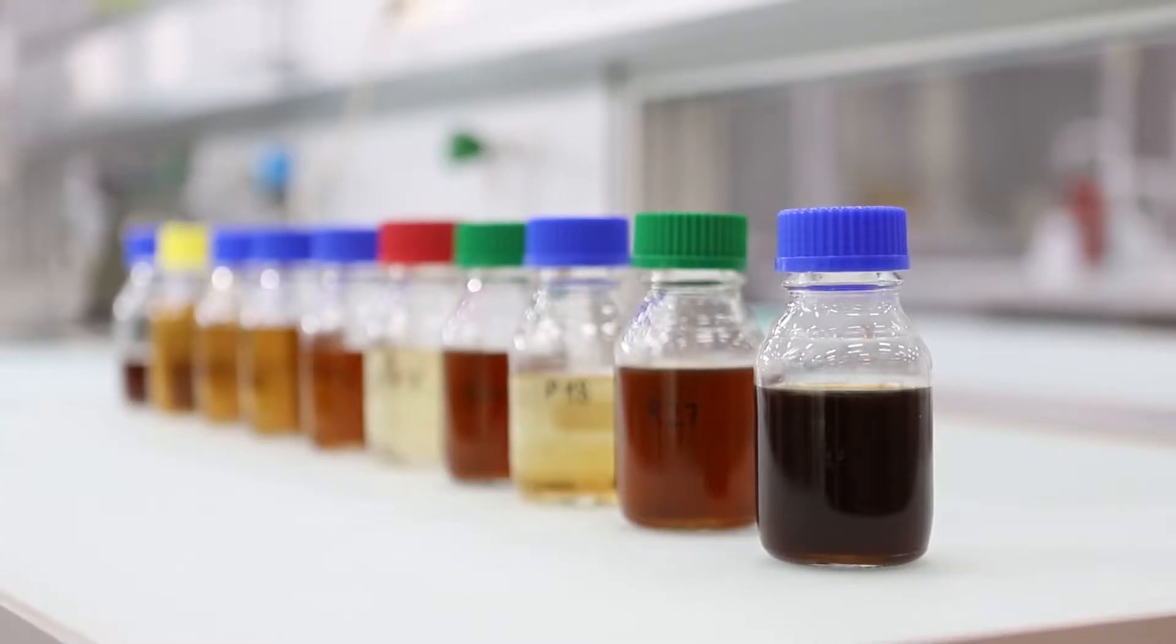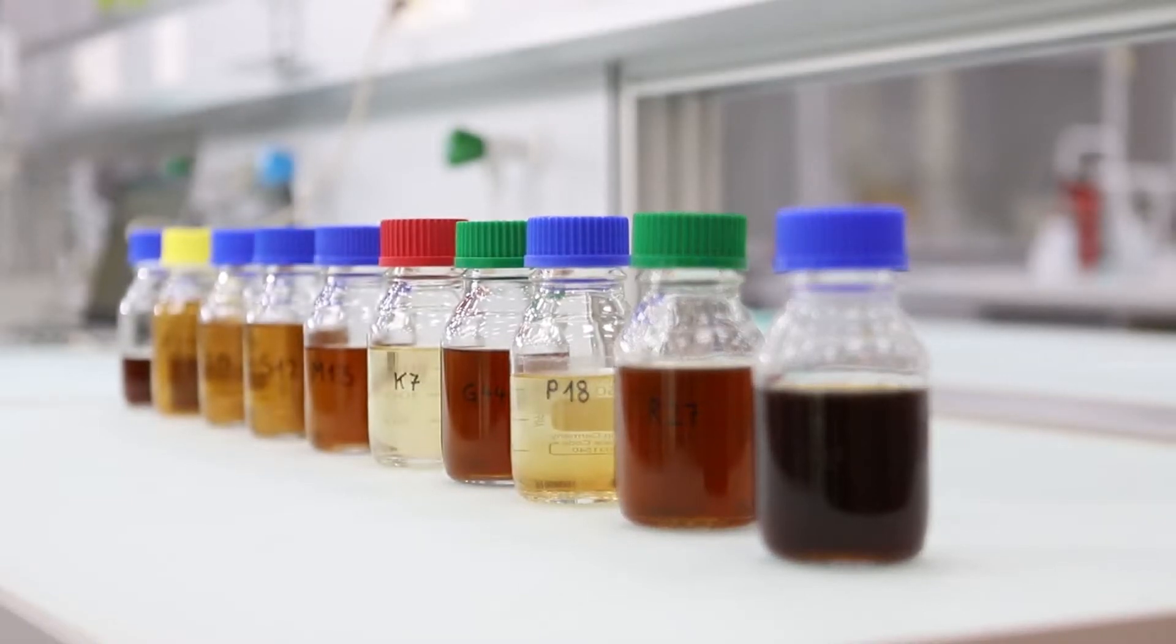Samples need to be filtered to protect the IC system and the analytical column in particular, because many samples, even water samples, contain particle contamination.